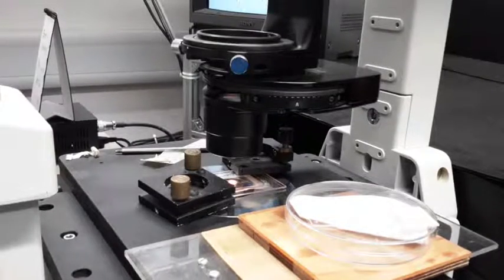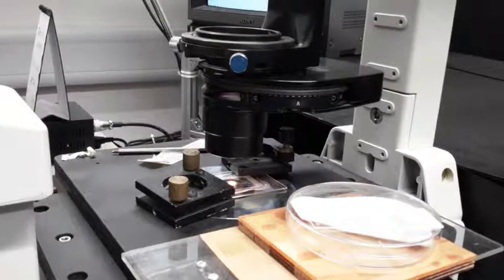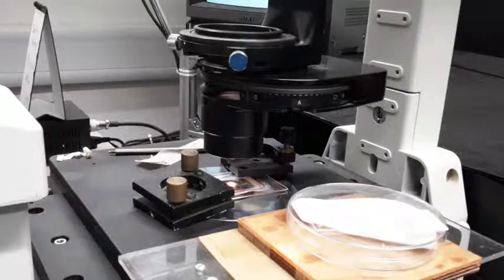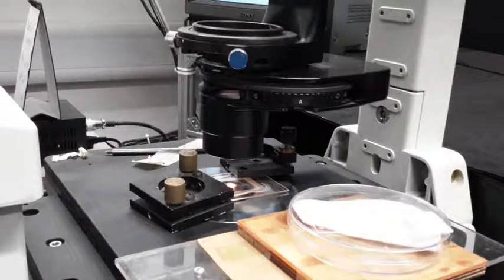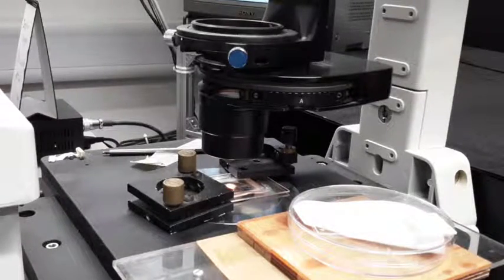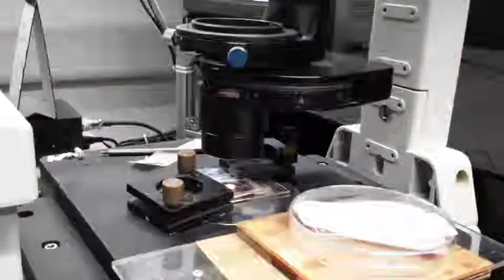In our experiment, we used an inverted light microscope. The light source was positioned above our sample, while the camera for image processing was below the sample stage. The images recorded by the camera were played on the TV monitor. The sample we used contained styrofoam spheres suspended in aqueous solution. We moved the sample manually using the stage for the microscope.